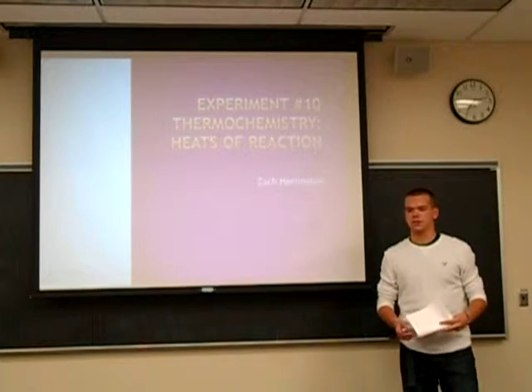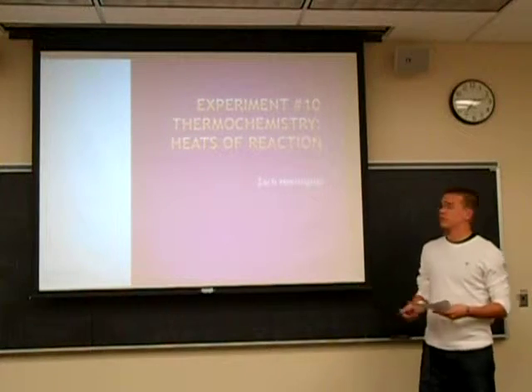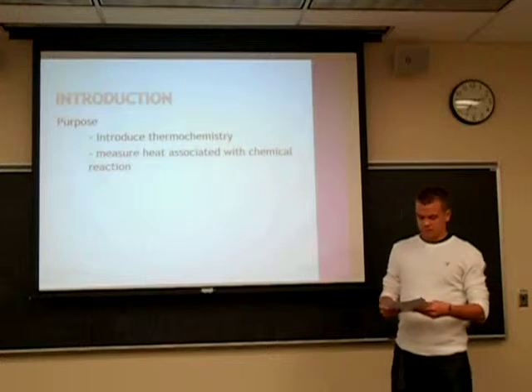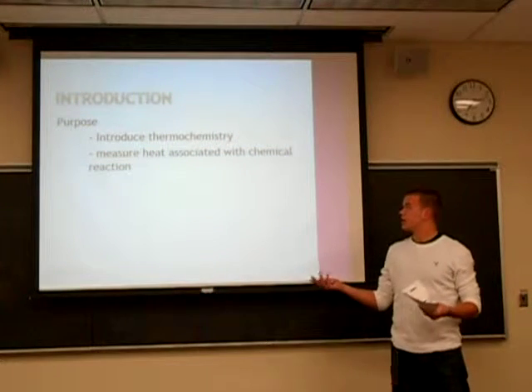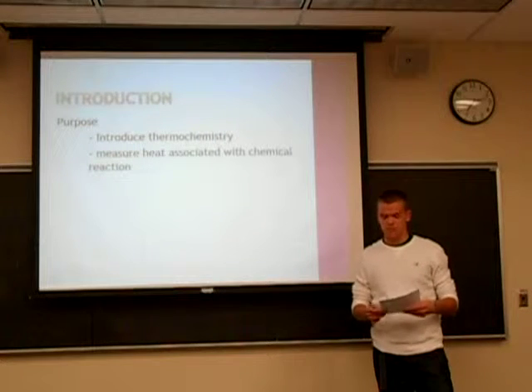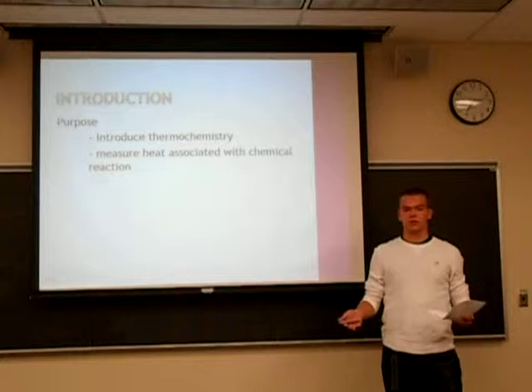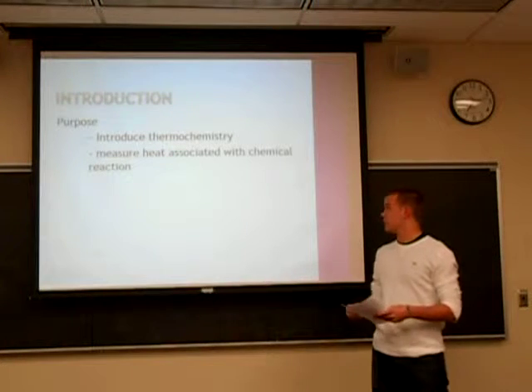My name is Zach Harrington, and I did my oral presentation on experiment 10, thermochemistry and the heat of reaction. The purpose of this experiment was the introduction of thermochemistry and to measure heat associated with chemical reactions. Also, it was to study heat change during physical and chemical changes.